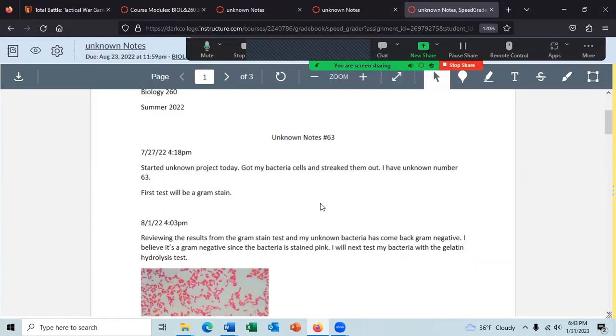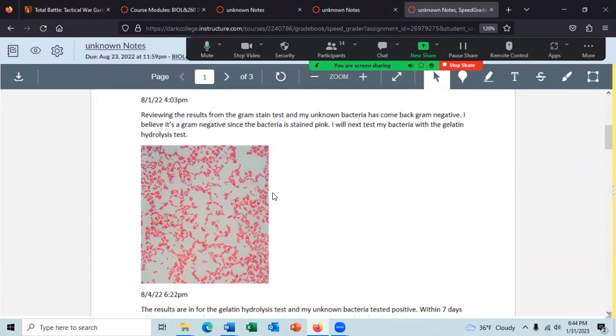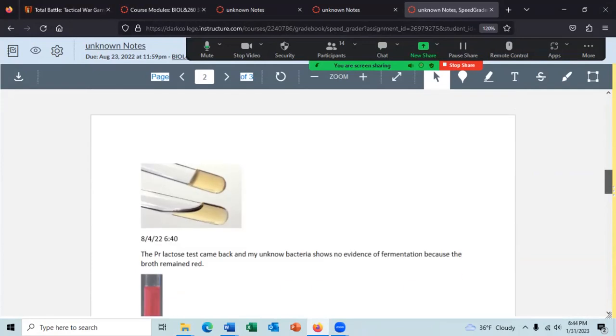All right. So you don't really need to put the date on it because the system will date it and the time, but here he's reviewing the results I sent to him, and then he's discussing what the results were for the gelatin hydrolysis test and probably the gram stain.